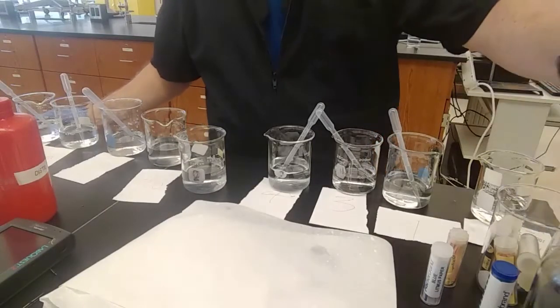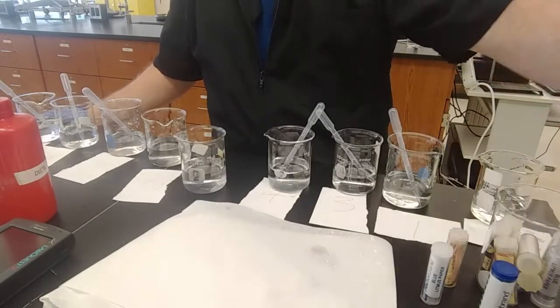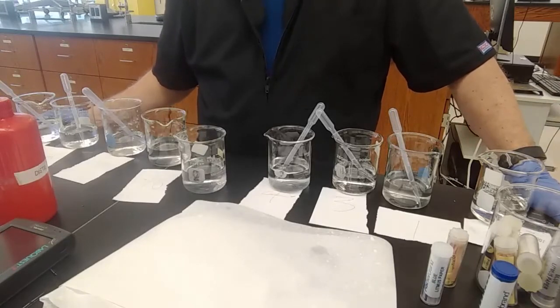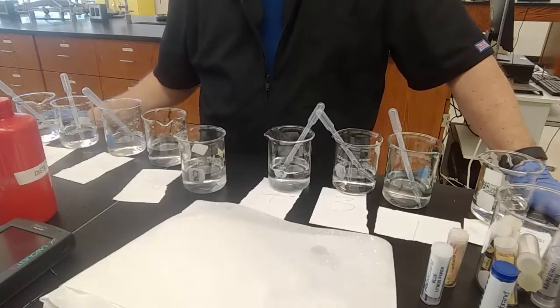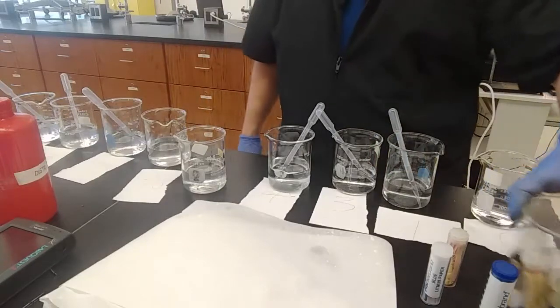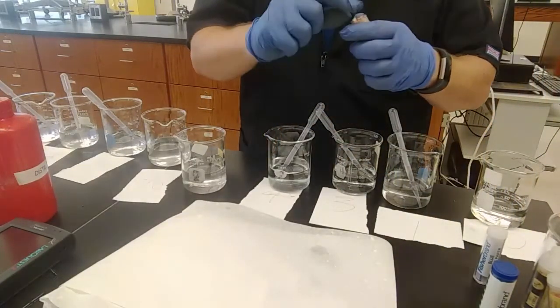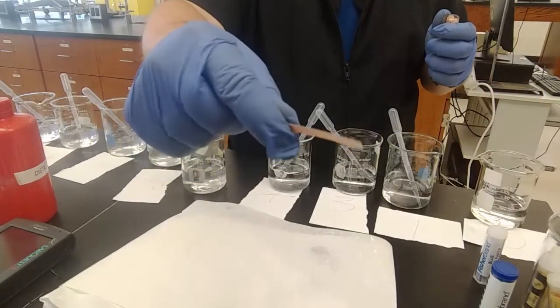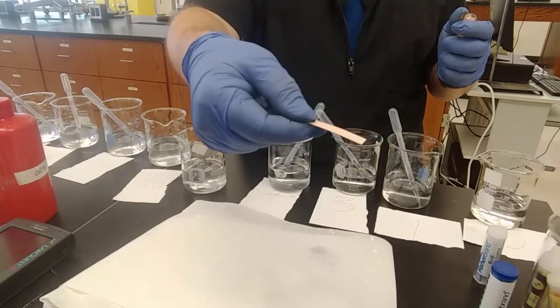Similarly, the Yamada's universal indicator that we'll use later can be made at home with cabbage juice. If you get red cabbage and chop it up and soak it in some water, you end up with a pH indicator. And so if you added that cabbage juice to vinegar, it would turn red, and if you added it to oven cleaner, it would turn blue. So we use the 2 different colors because if you dip red litmus paper into acid, it's not going to do anything because it's already red. But if you dip blue litmus paper in acid, then it will turn red.